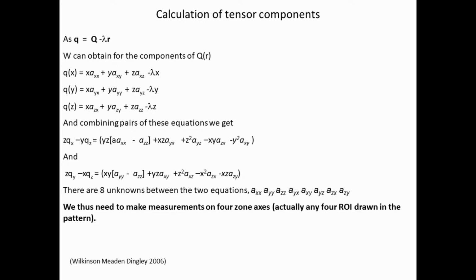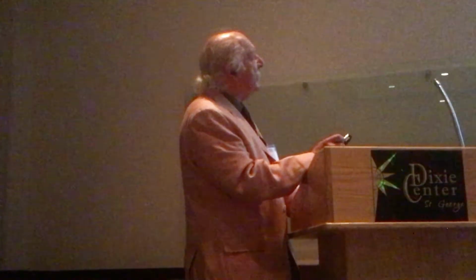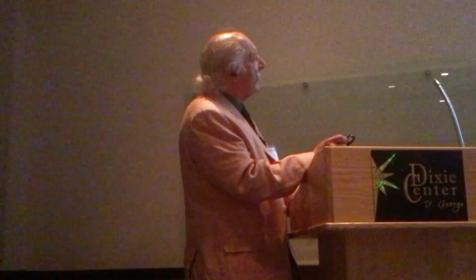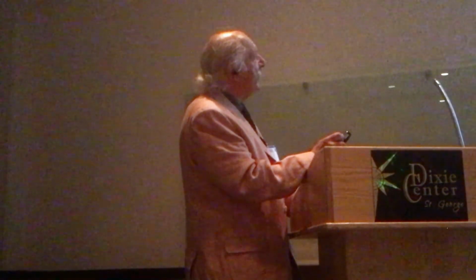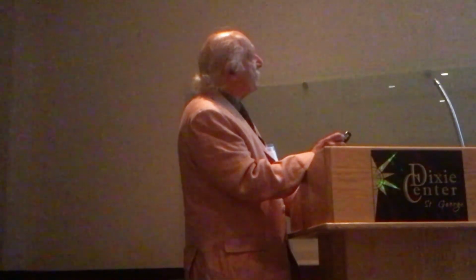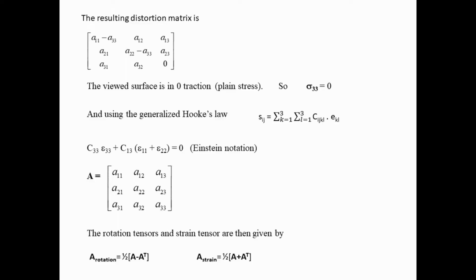Right, what we actually measure, and it's important to remember this for something I'm going to say later on, is this deformation tensor, because we cannot measure out of the plane of the phosphor. The diagonal elements, the third one out of the paper, we get as 0, we can't measure it, and we get the first and second normal strains as a difference, A11 minus A33, A22 minus A33. It's important to remember that little thing for what I'm going to say later about pseudosymmetry.